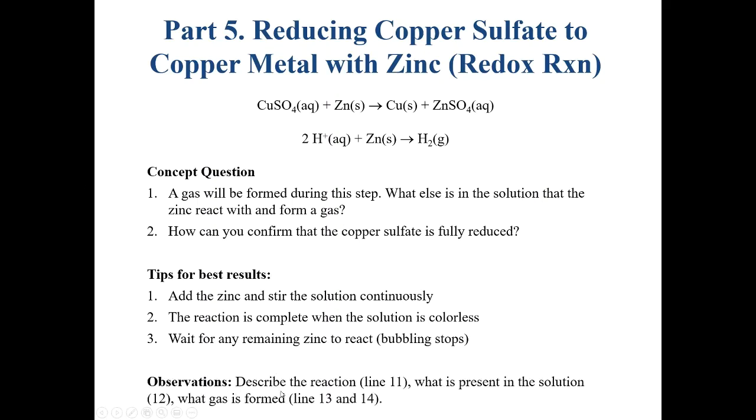For your observations, you're going to want to describe the reaction. This is on line 11. What is present in solution? I've given you some ideas of what might be present in solution. And for the gas that is formed, I've given you some suggestions for what the gas might be. Part of the reason we're being a little more helpful with this is that in lab, you'd be able to see this and think about it, but since you're watching it in video format, we're giving you a better sense of what's going on.